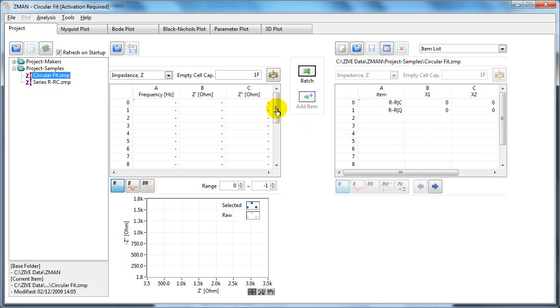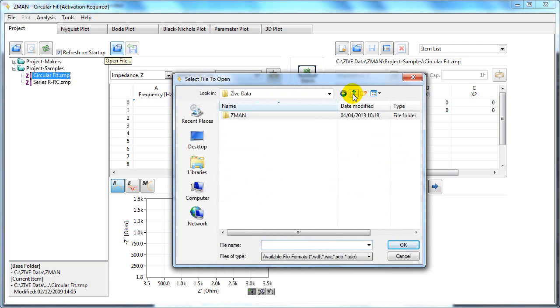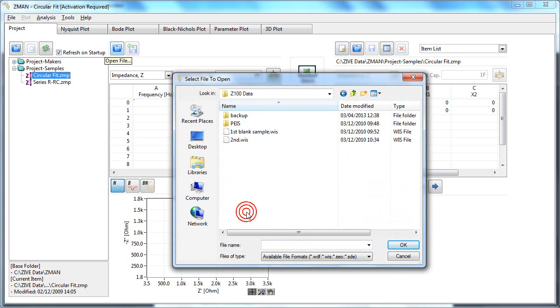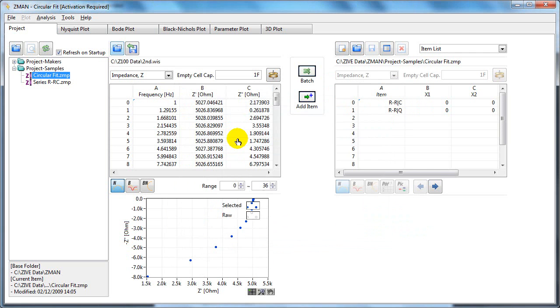If you've just collected your data from Navigator software, you'll have to create a new project and find the file. So if you click here to open the file, you go to the Z100 data. And here, for example, if you want to open this file, you can double click and it's displayed here.